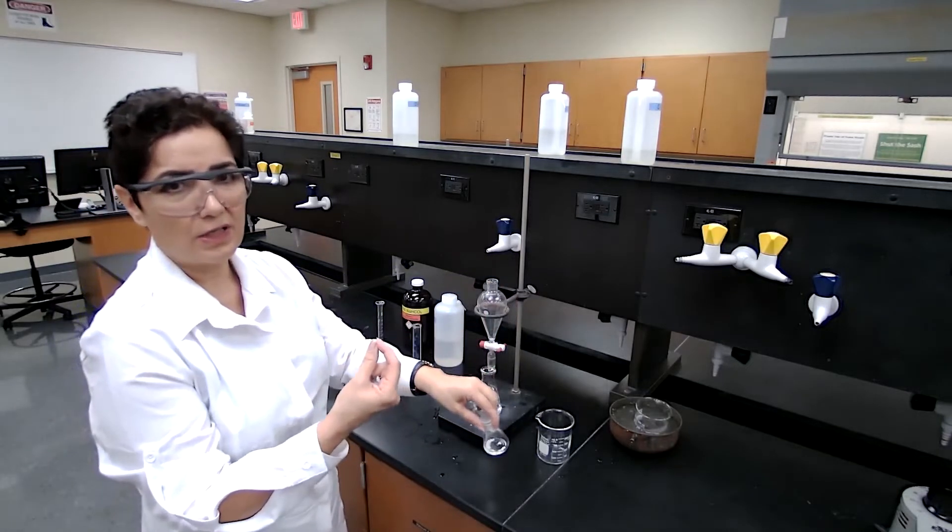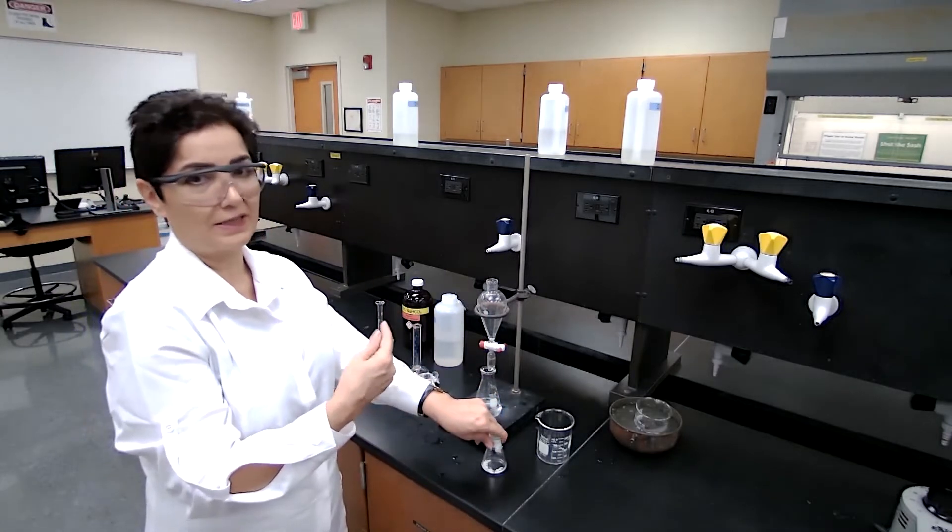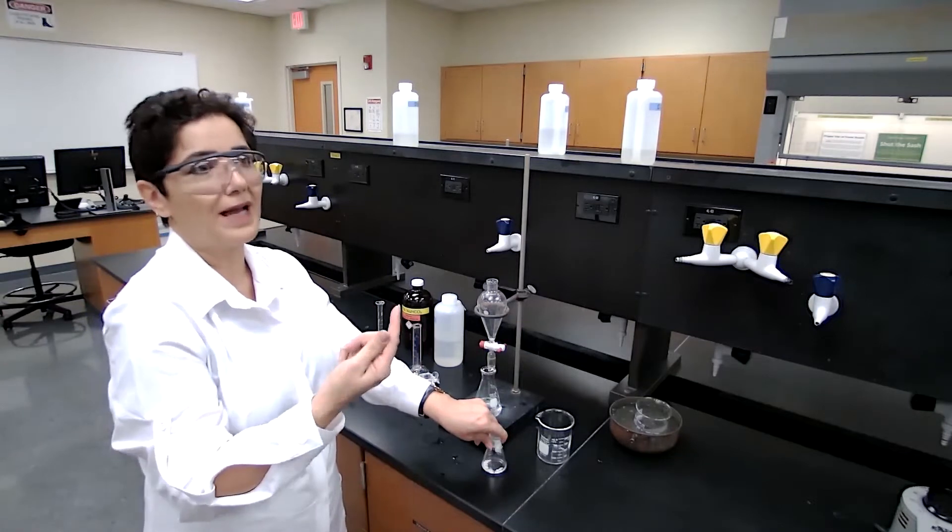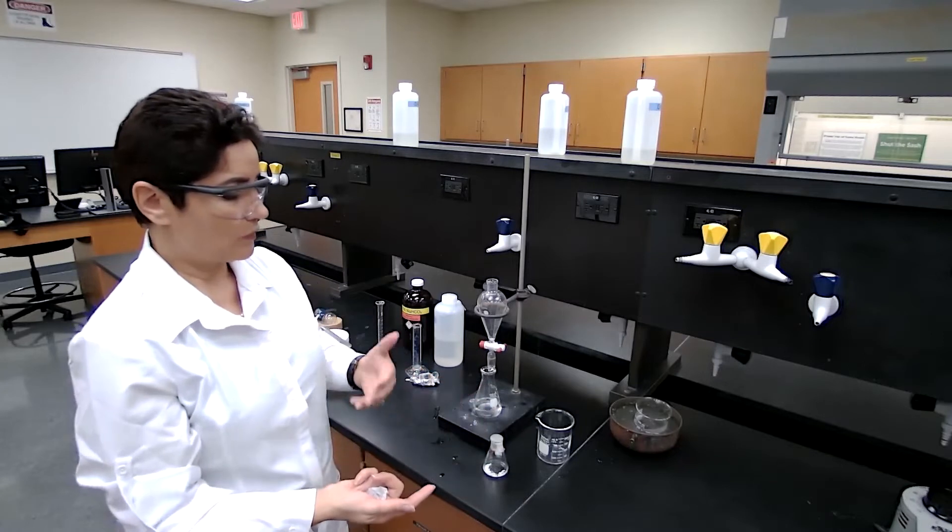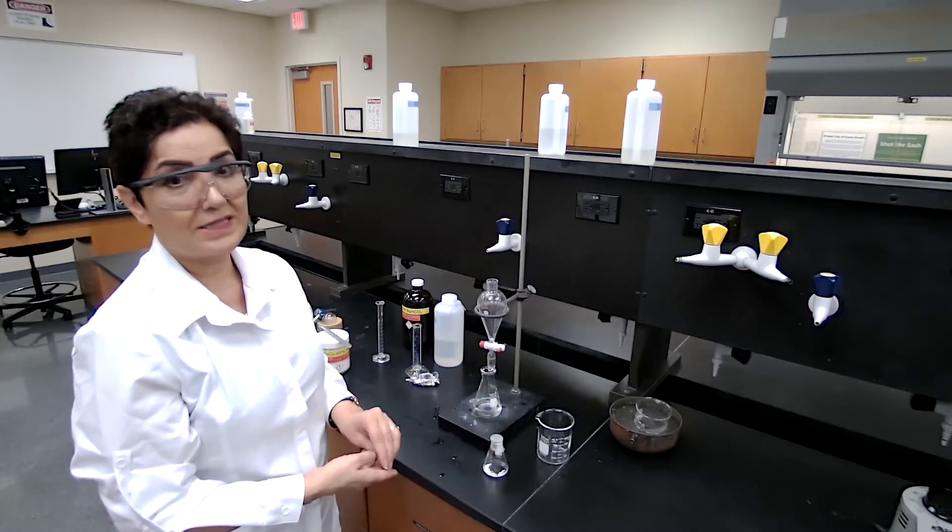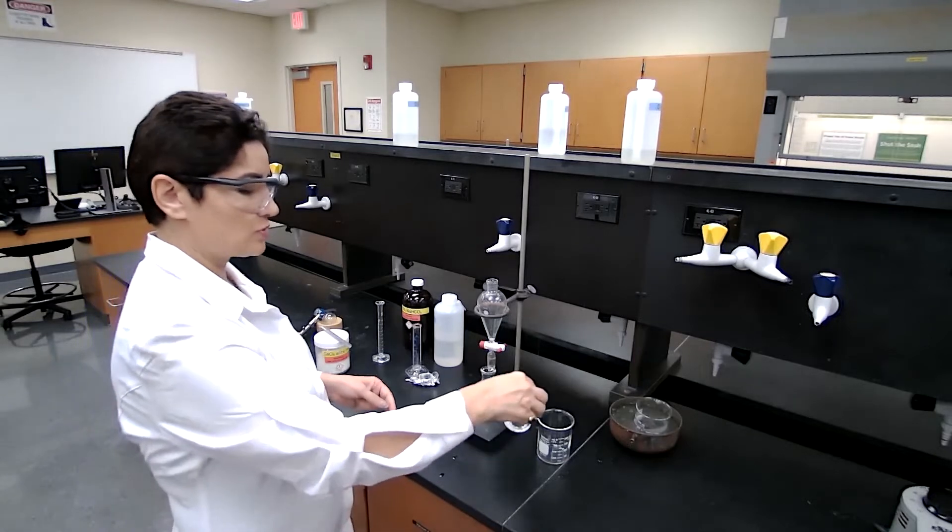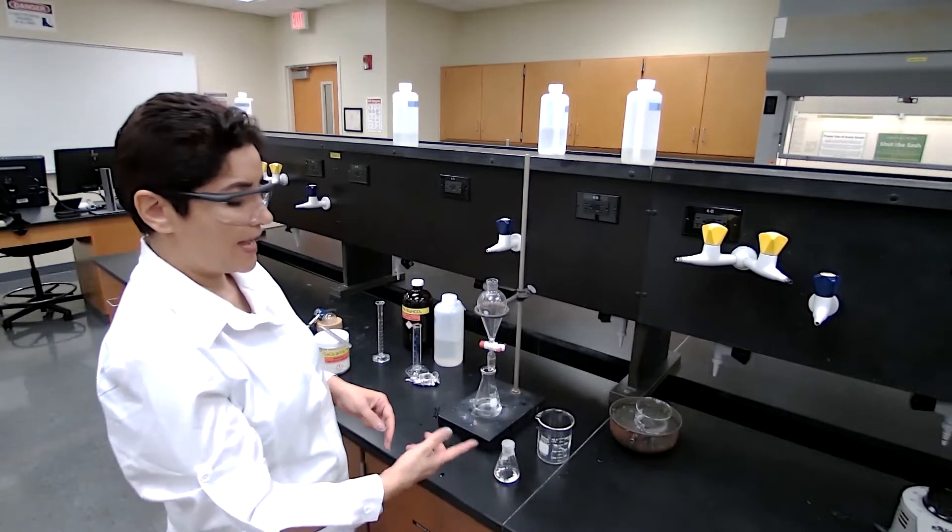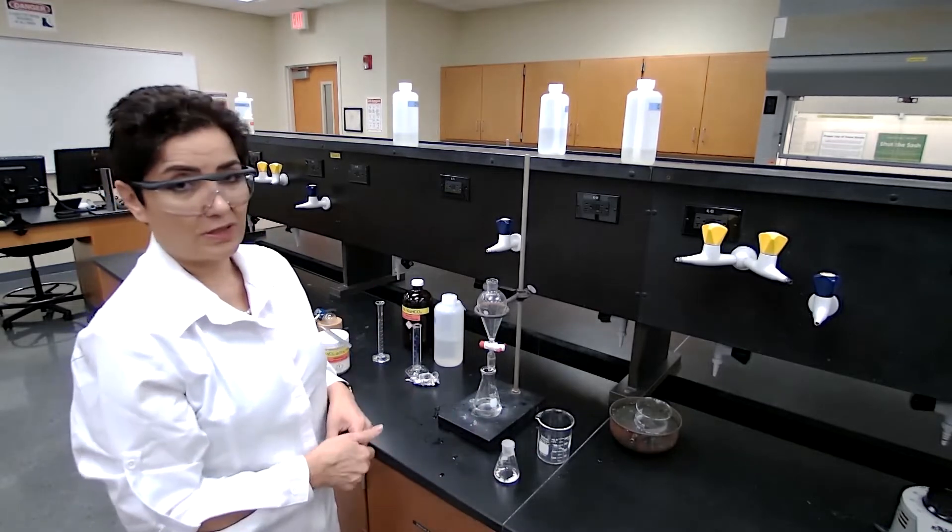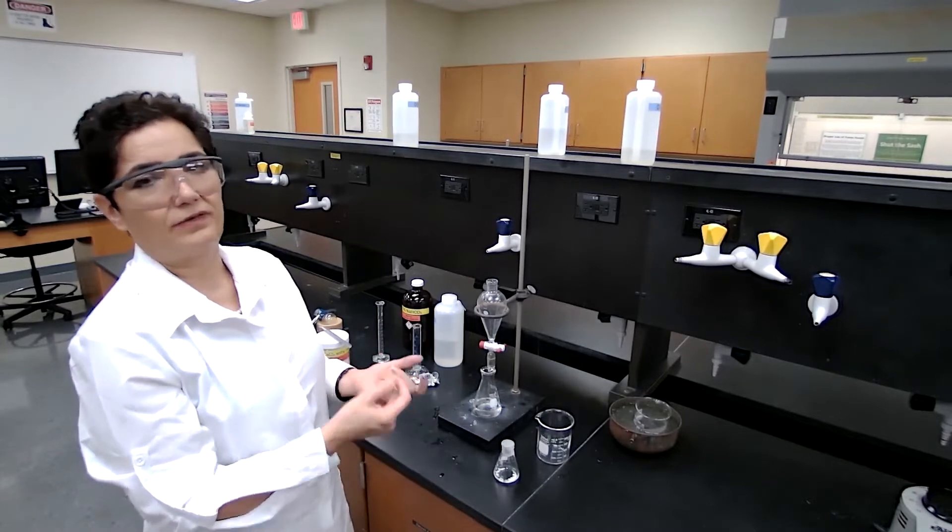For the dry sample, now I can measure the mass for percent yield and do the chemical test for the functional group. Because the cyclohexanol is not substituted and gives only one alkene product, we have one product here. But we can check for the C=C double bond with two chemical tests. I'm just going to wait two or three minutes for it to dry and measure the mass using a pre-weighed flask.